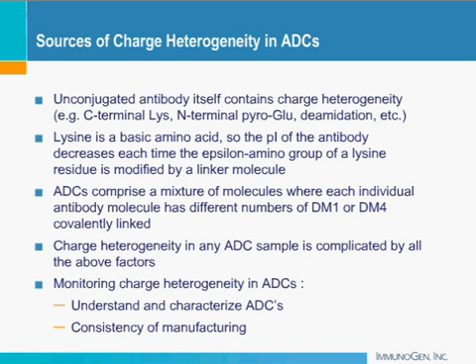Coming to the last part of my talk, I will talk about analysis of the antibody by the ICIEF method and how this method was evaluated for various parameters like reproducibility, linearity, precision, and then eventually this method was used to look at the level of unconjugated antibody in our conjugate samples.